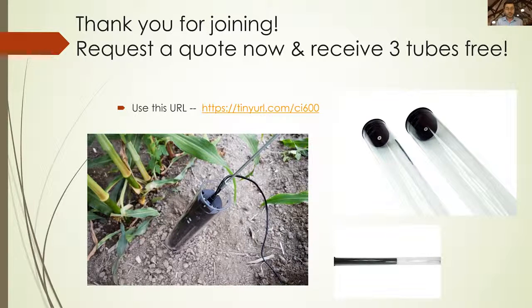The next question: it'd be nice to know if any development has been done in the software to get the statistics of all the roots, including total length, by single click, as done in destructive root image analysis. So there has been some adjustments. I kind of went over a few of them to get the full information from the root system, but we are more than happy to add more. As I might have mentioned previously, our software engineers are currently developing another update for the RootSnap software. And any ideas, we are definitely happy to entertain as that software is being developed. It's very important for us that it works as easily for you as we can make it. And once that's done, we will send that out to you for free.